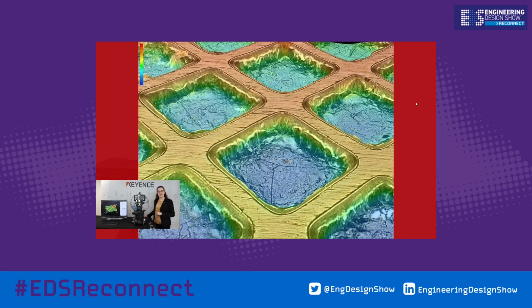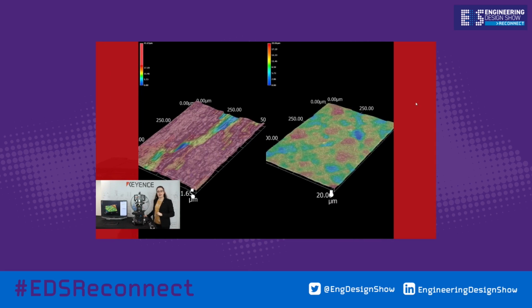Here we've got a printed section. There's a grid printed onto plastic or paper, and you can really see very clearly where the raised sections are, where it's been printed onto the surface, and the lowered sections there in the blue. Finally, we've got a comparison image. This is actually some rubber. So on the left-hand side, we've got one that is fairly smooth, but with a deep valley down the middle. And you can really clearly see that with the red raised section and the blue and yellow going down the middle. And then on the right-hand side, we've got a much more bumpy surface, just very uneven over the whole thing, hence the spattering of red and yellow and green and everything on there.